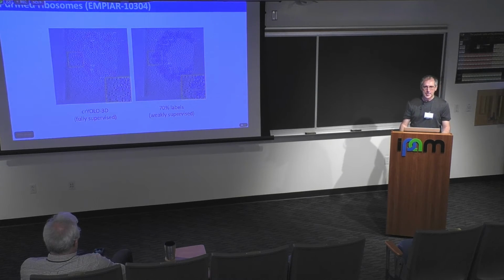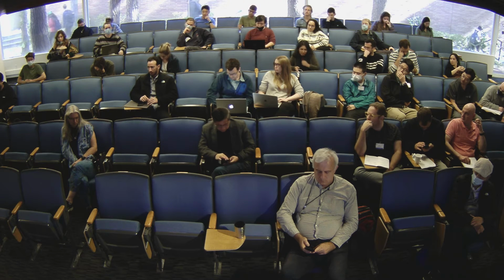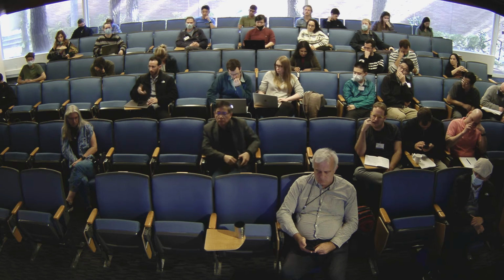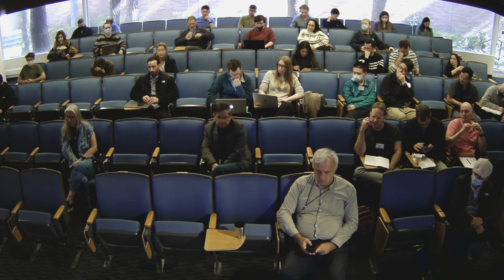Because I was performing this for single particle, in which I do, for example, 4 by 4. But yeah, at that point we had some trouble, so I had to do 3 by 3, and to me this was a huge achievement. I know people do 10 by 10, so you can really speed things up by using this technique, and it actually works in practice, and there are several examples of that. Yep.